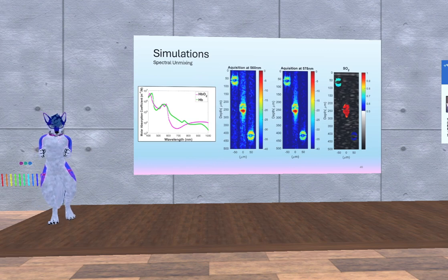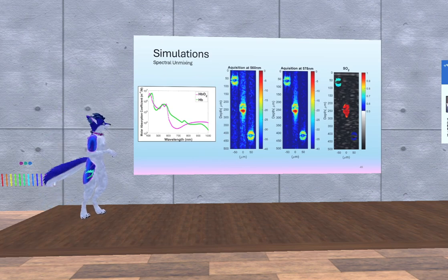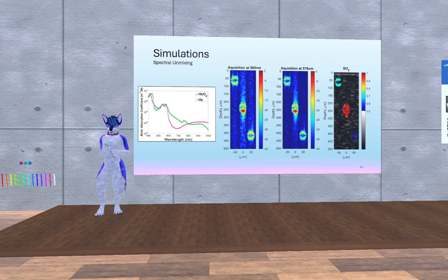One of the hallmarks of photoacoustics is that because it's imaging optical absorption, a lot of chromophores, even when they have very small differences, have very different absorption profiles. To highlight that, look at oxy and deoxyhemoglobin. I don't know if any of you have ever seen on one of the health apps on your phone, you can put your finger up to a light and it tells you your blood oxygen saturation. Or if you've been in a hospital and they clip that little thing to your finger and it gives you your blood oxygen saturation. It's working off this effect essentially, and it works really well in photoacoustics. You can map out blood oxygenation structure. You can map that out inside of a living thing.